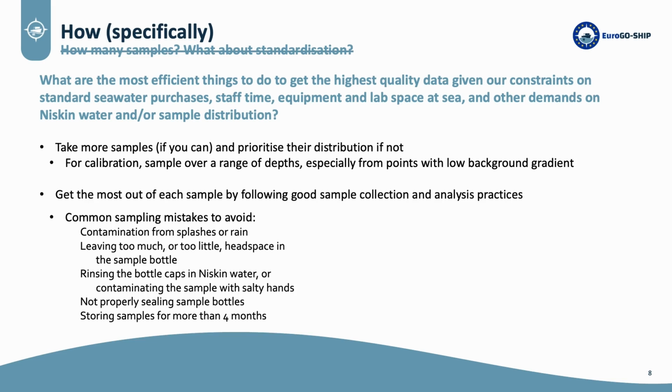Another problem is not properly sealing sample bottles. It's just something to point out to your samplers to be careful with. And finally, storing samples for more than 4 months. They do degrade.